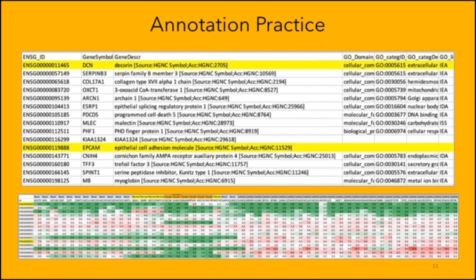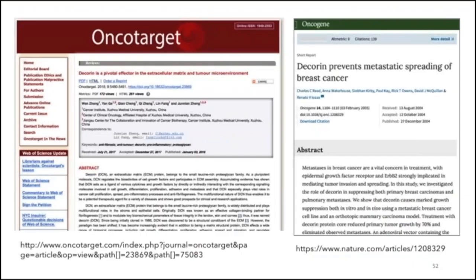So first of all, remember, this is the heat map that we built, right? And here we can see those 2 genes highlighted as well. The first gene has green in the first samples and goes to green again in other samples. So it's not really present in a lot of these samples. And the one towards the bottom, some of it is highly expressed across the samples. But in our case, let's take a comparison of these 2 groups. So we will compare basal-like and normal-like. Instead of looking at everything, we will just look at 2 small groups.